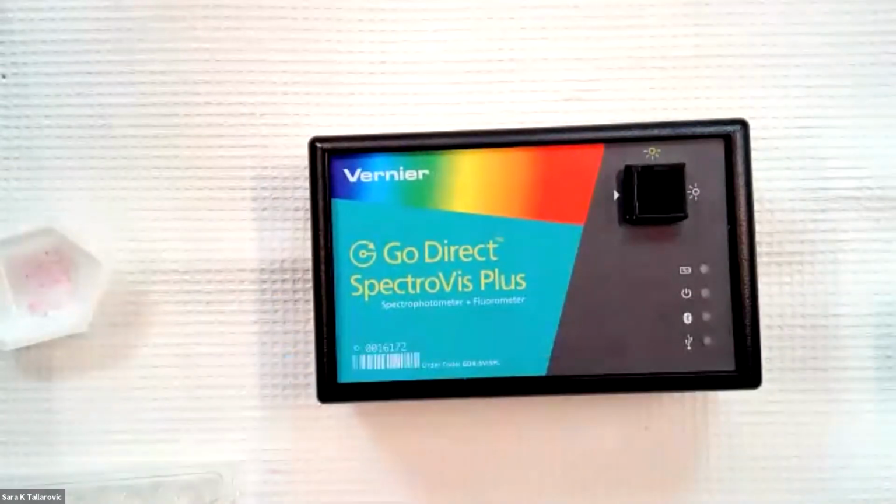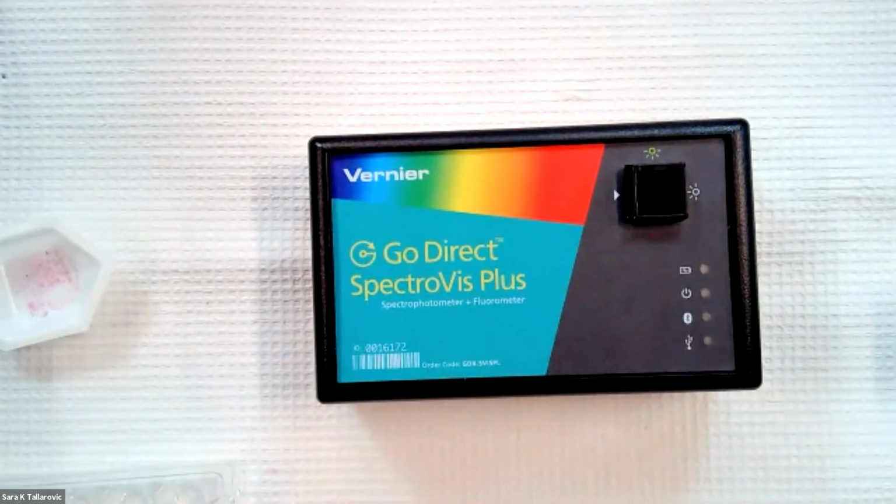So I mentioned earlier that you can do these labs also with a spectrometer. And if you were to do that, we can just briefly show the difference. The GoDirect SpectroVis Plus can be used for this lab. And if you do have a spectrometer, then you may already be aware that Graphical Analysis does not work with spectrometers. For that, we have a different software called Spectral Analysis.